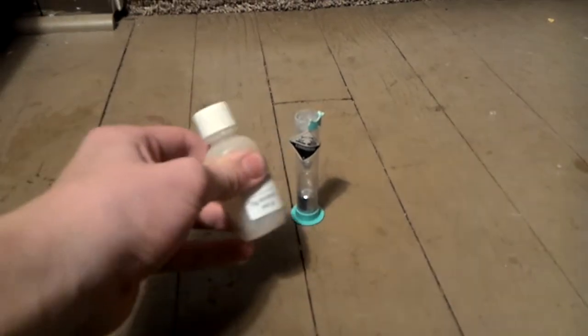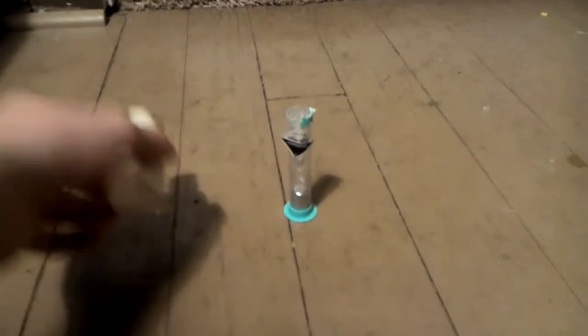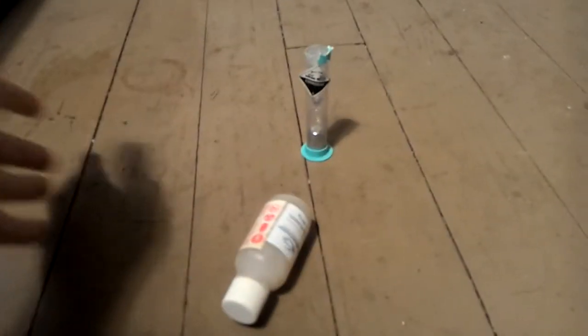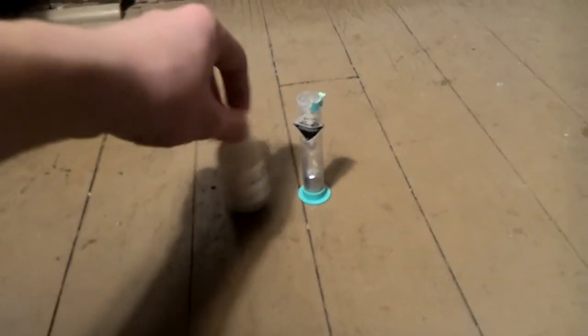The pros of the plastic is that it's flexible, you know, so you can squeeze it, you can drop it, and nothing will happen to the mercury, or you, if you have the cap on tight enough.